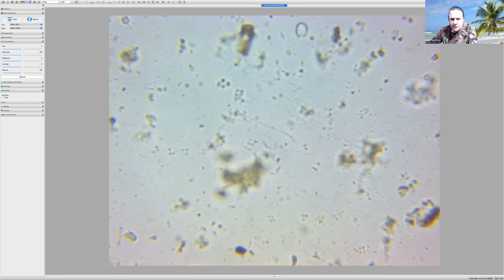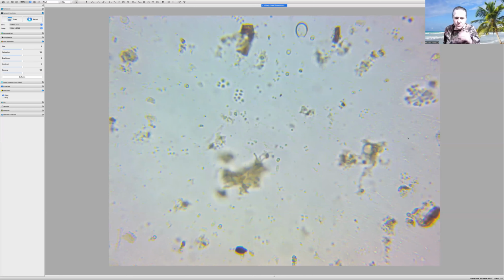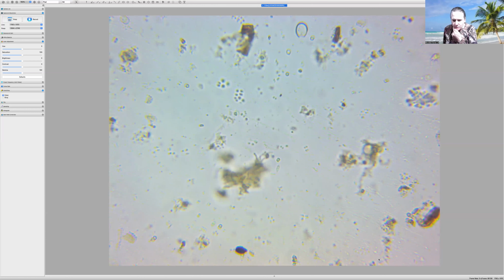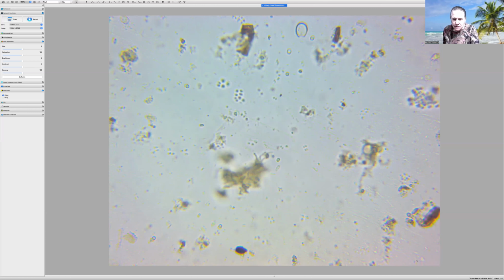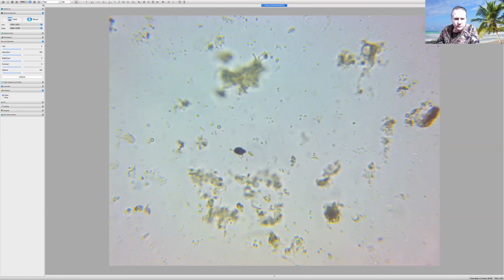Well, they may be running a little low on the foods that they prefer. This looks like a flagellate here. See this moving right down here? That's going to be a flagellate. This here would most likely be a ciliate. They move so fast it gets hard to follow.